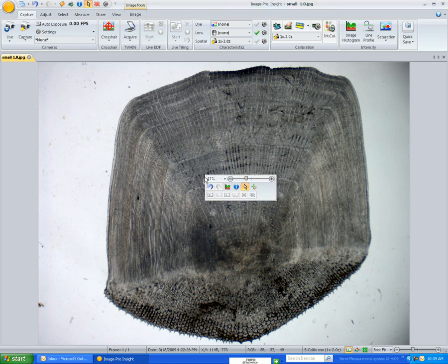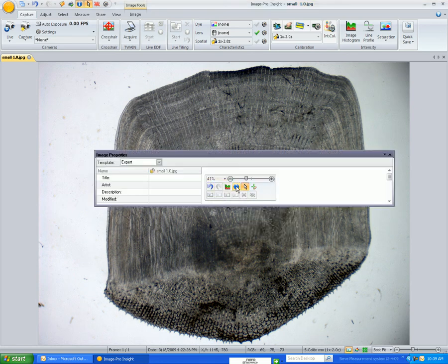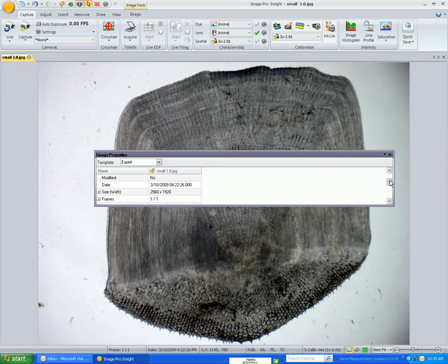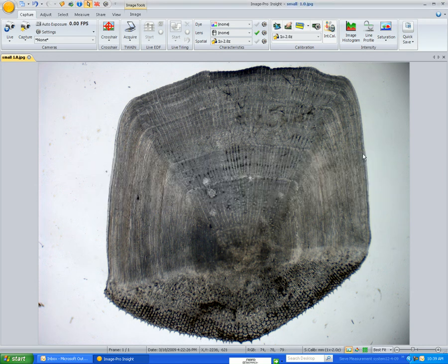If I right-click on it and go to Information, it will show me right here that the spatial calibration has been applied.